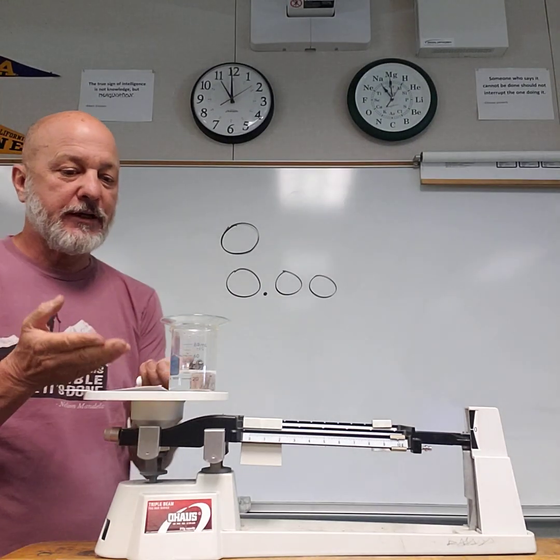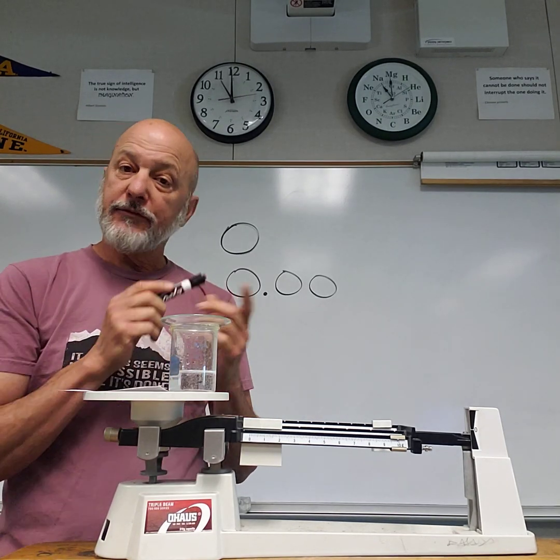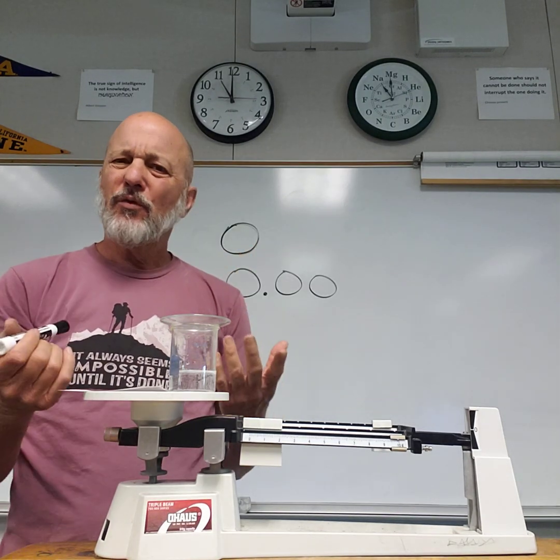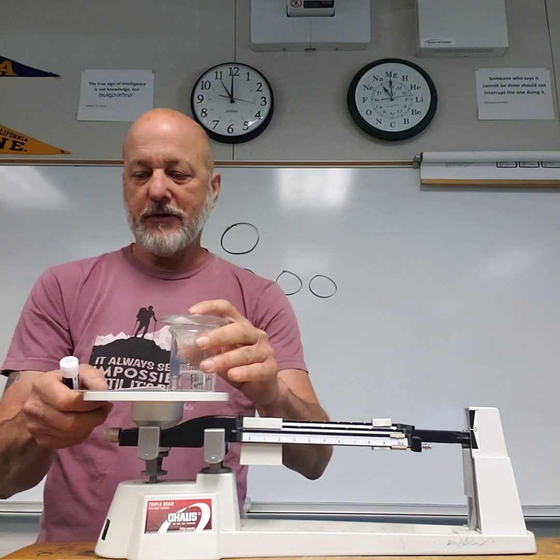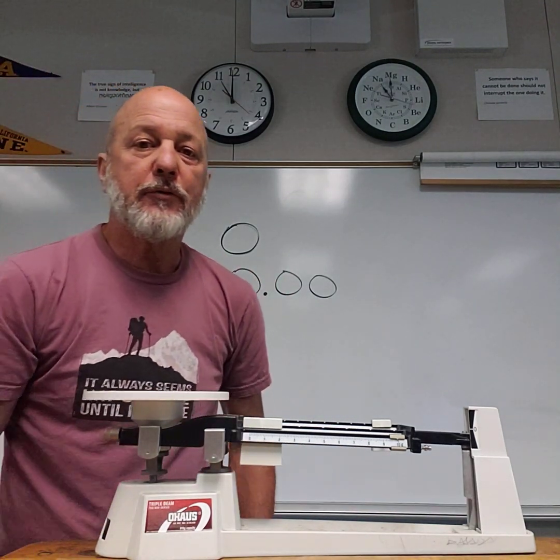So that will be the lab, okay? And then you check this, and once it's all bubbling, what happened to your mass? If you had a change in mass, what happened? What is that change in mass? Okay. And then I will post some questions as part of it.